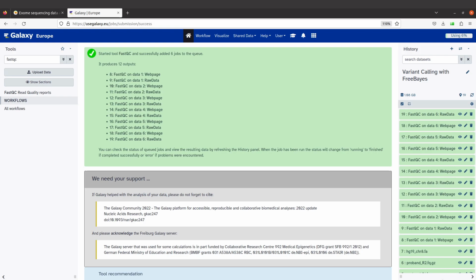A good way to view the reports is to aggregate all of them together into a single document, and then you can open that file using your browser, check the reports, and even compare the files to each other.